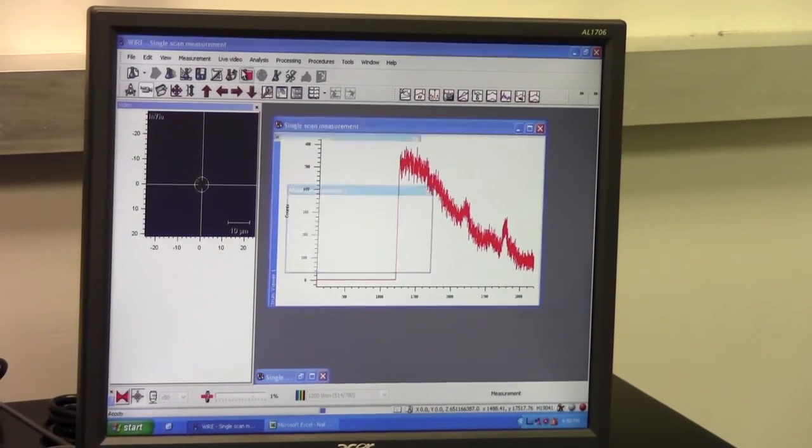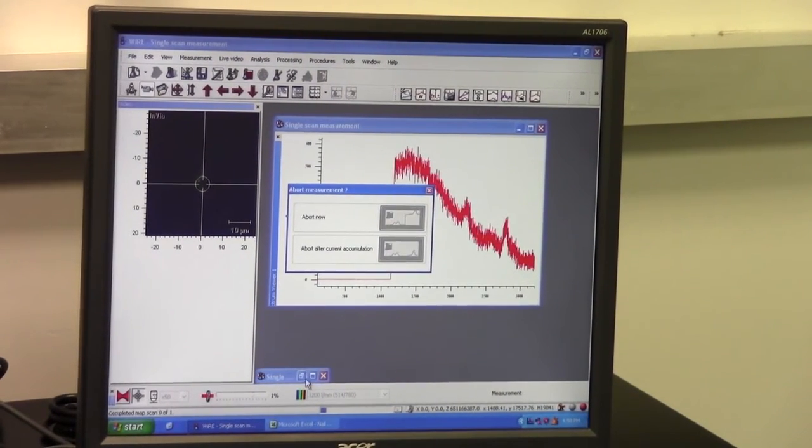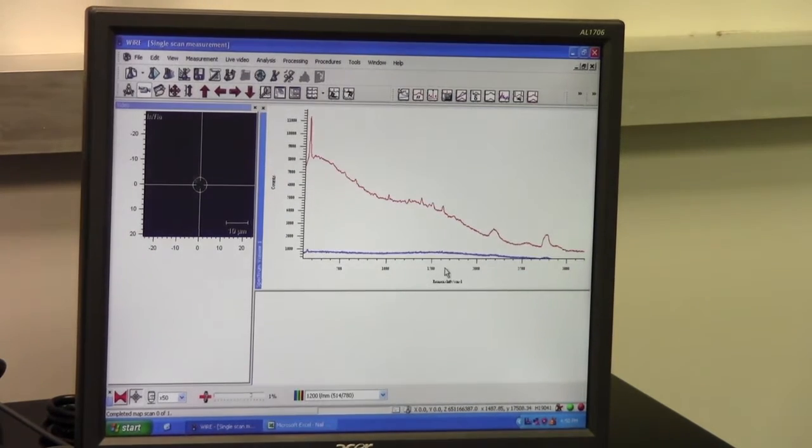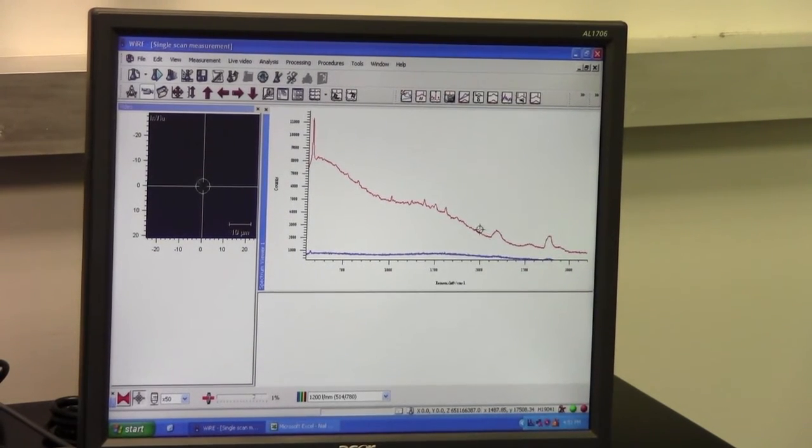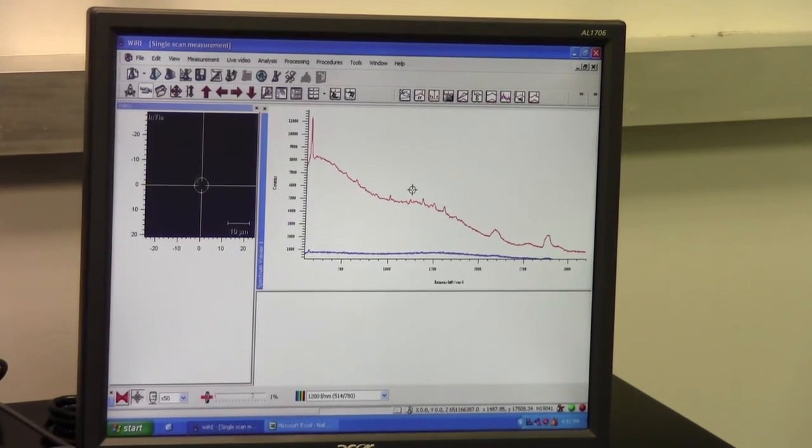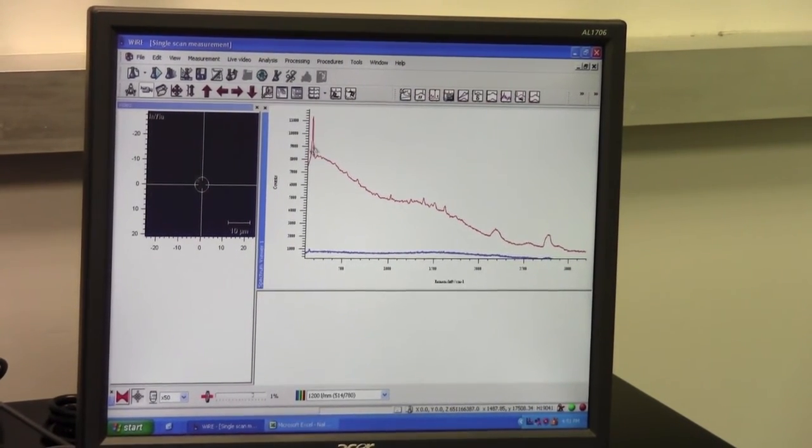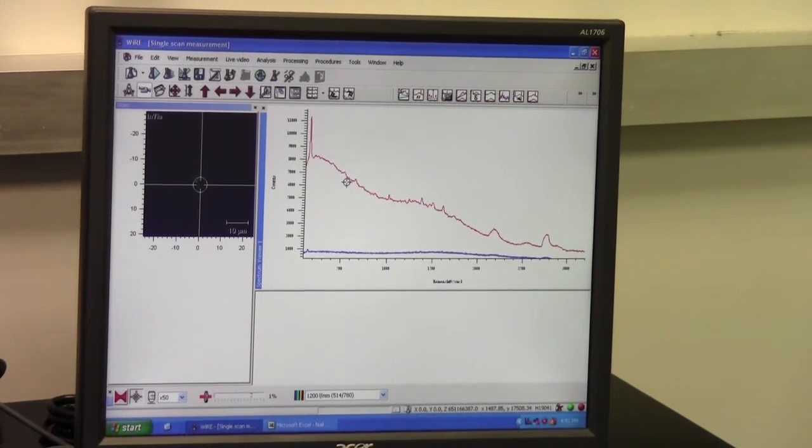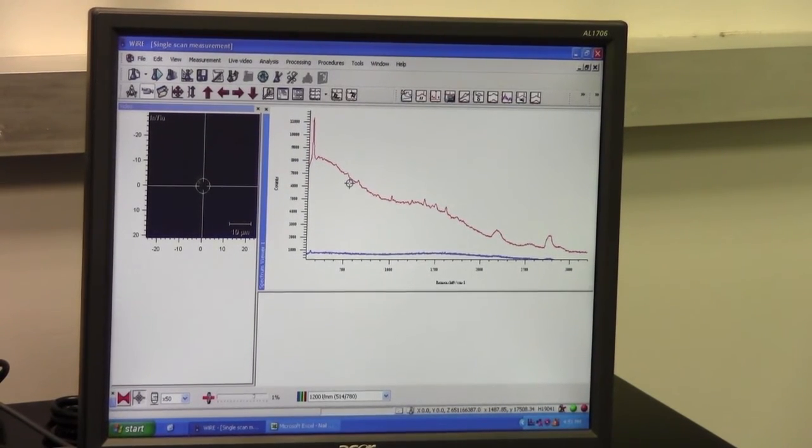After the end of a complete scan, this is what you're supposed to see. As you can see, there are multiple peaks here. Multiple peaks means multiple fingerprints for different components in a sample. That's how the Raman works. By knowing about these peaks, you can really tell what chemical compounds are present.